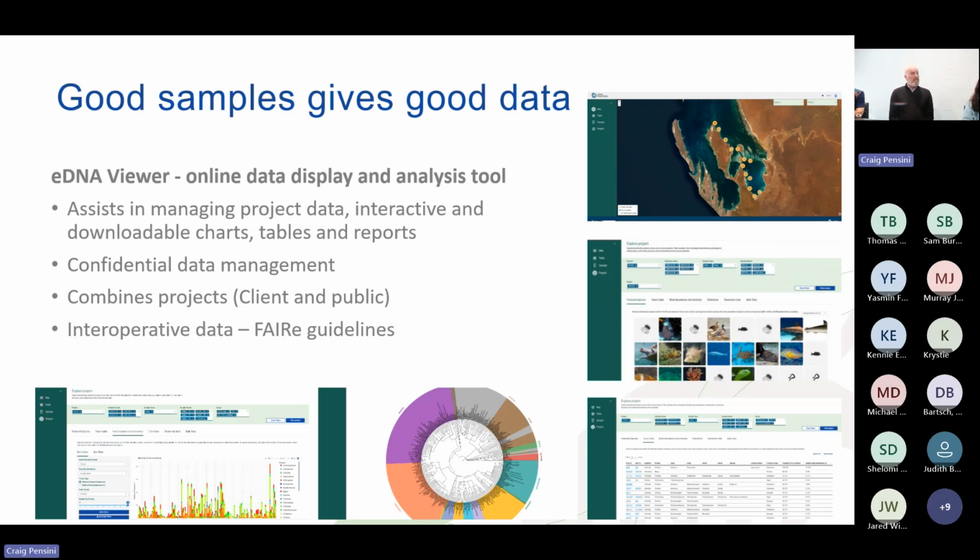If you collect that metadata, like lats and longs, then we can map it. We'll try and get everything that hits a species level a link, which is the second picture there, through to Wikipedia, through to NCBI, and through to GBIF, and all of the good databases that have heaps of information on it, as well as the taxonomic list, of course. And then some interactive graphics displays like your phylogram and some richness plots, etc.